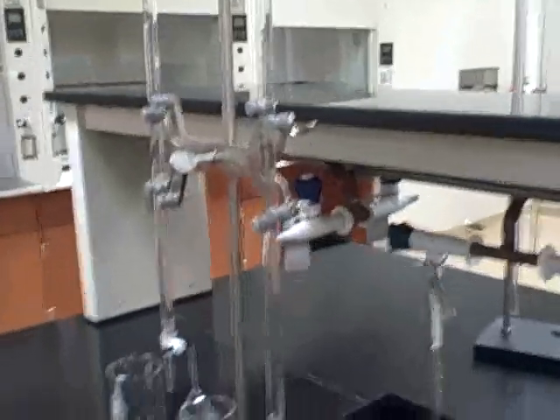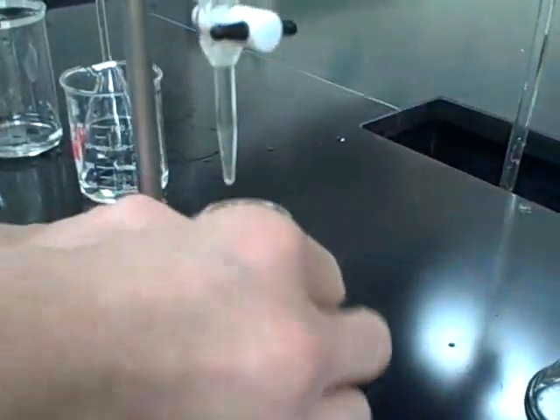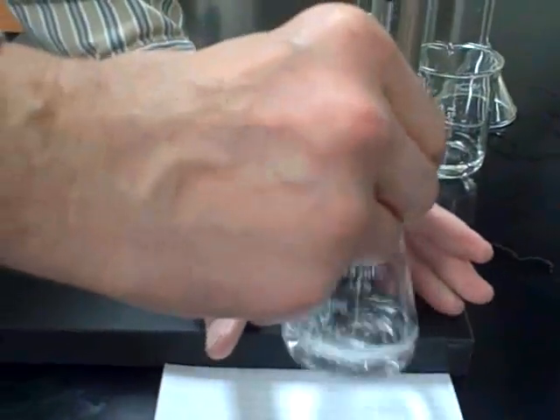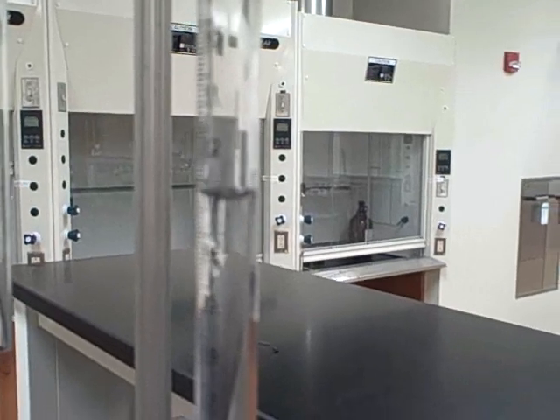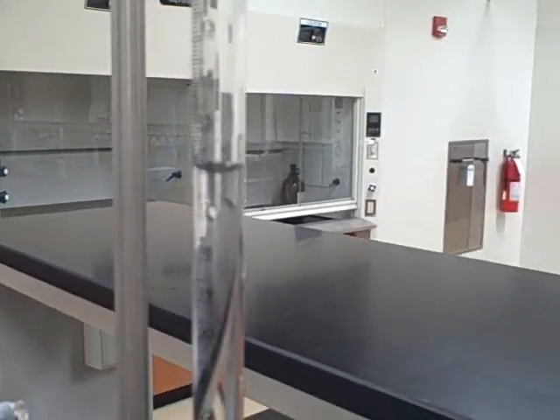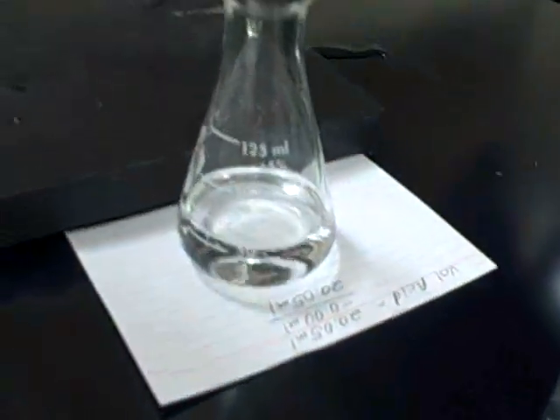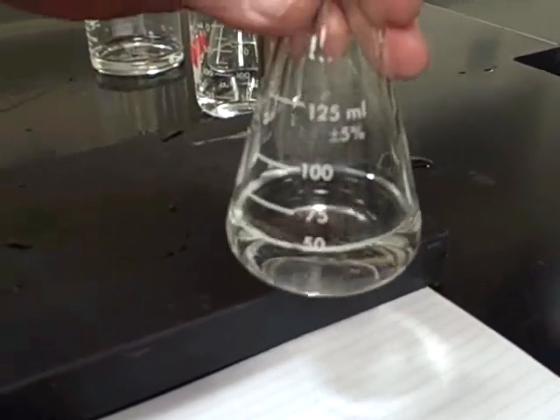And now I do the titration. I know that my base is about the same concentration as my acid, so I can get close to 20 milliliters here before I have to start being really careful. If they know how to do a titration, you can watch as you get closer — if you put in a little, you'll see some pink develop and then it disappears. It takes longer and longer for the pink to disappear as you approach the endpoint.